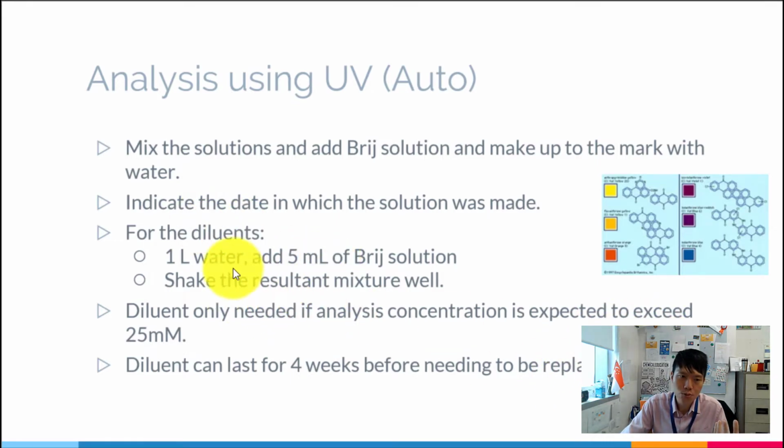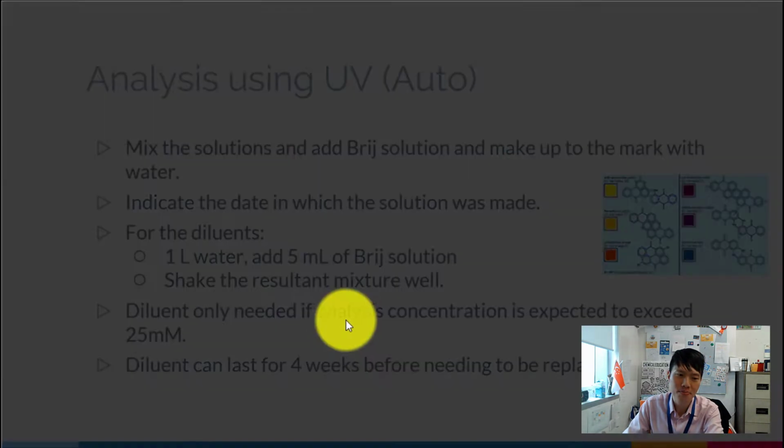Okay, don't just add water to dilute, because your substance here is organic. Water cannot dissolve organic; this is quite non-polar. So we need to use some surfactant, right? Surfactant can dissolve both aqueous and organic substances and mix them together. You want them to form at least not a heterogeneous mixture, but somewhat homogeneous mixture. So therefore, you need to take care of the durability of this diluent that you add, okay?